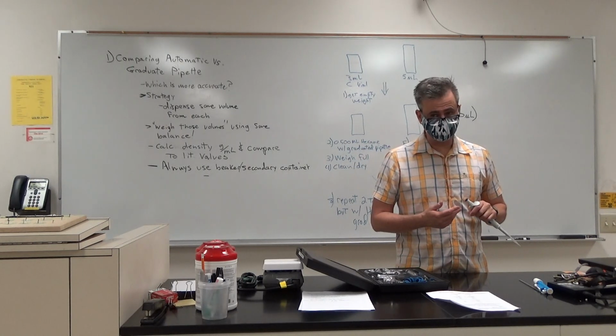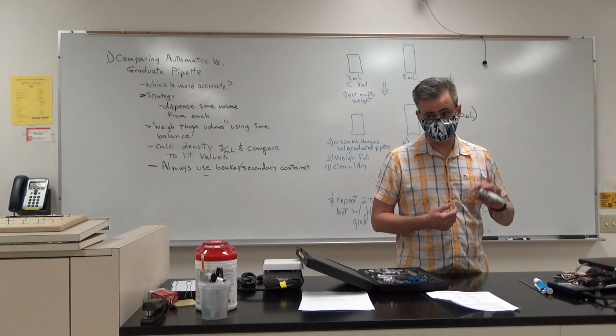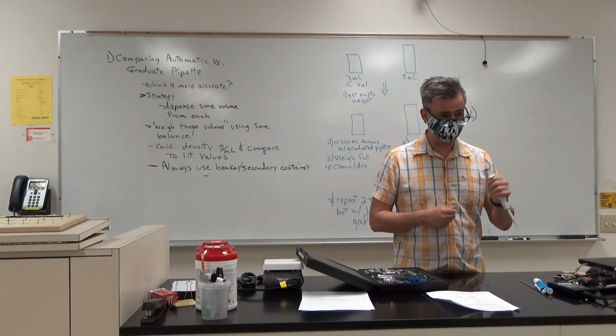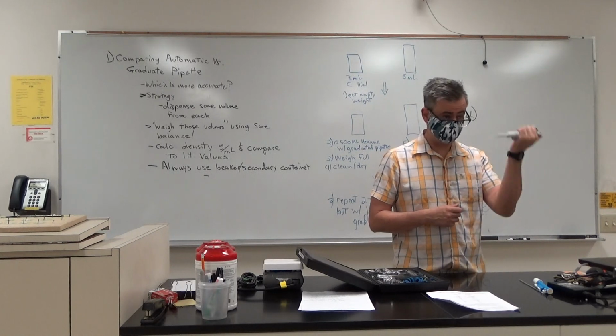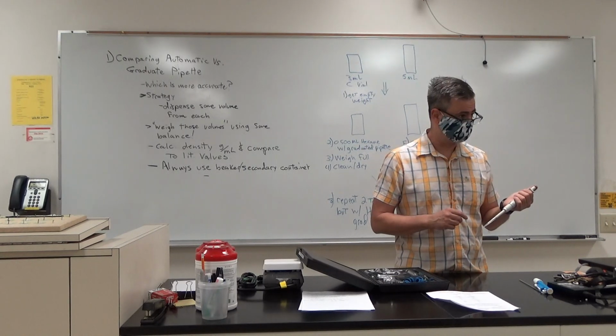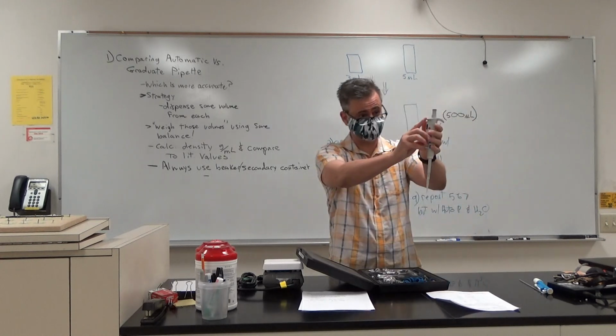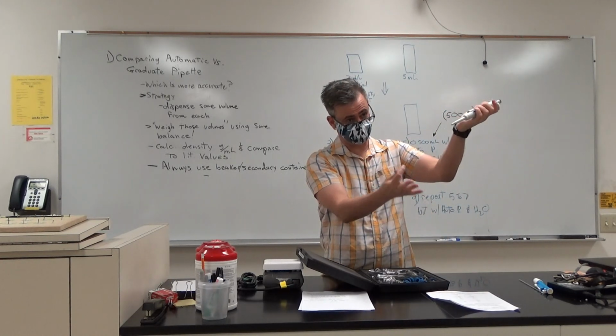You should only have to do a tip switch once. You'll do the hexane, and then you'll do the water, and you should switch tips when it comes time to do the water. The way you do that, there's a little button right here. You just push that, and it kicks this off.